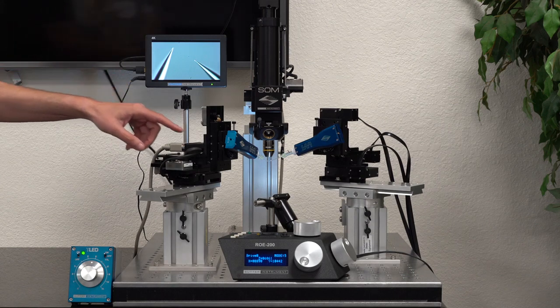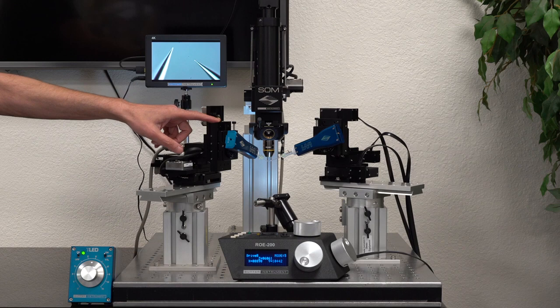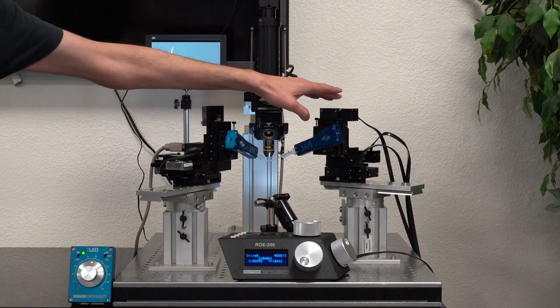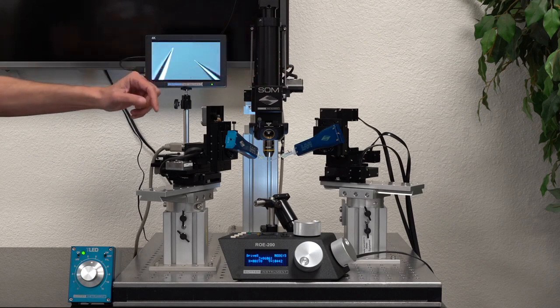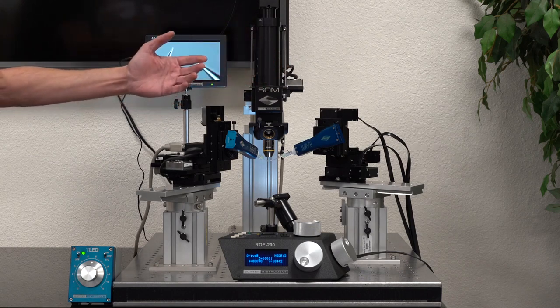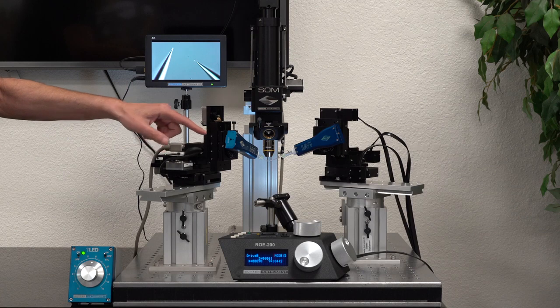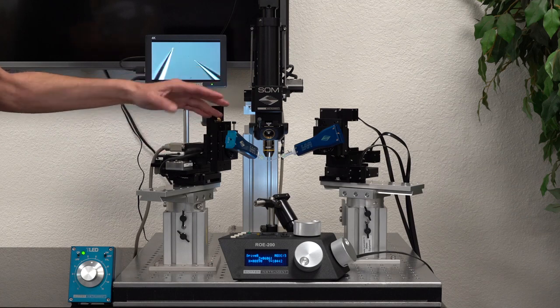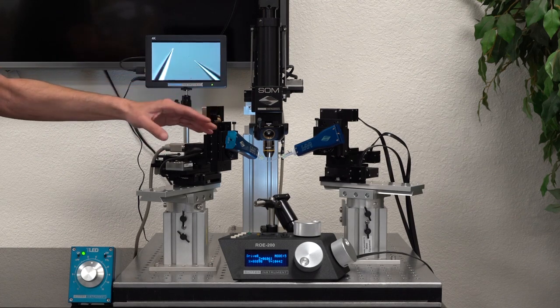In this setup here we have an MP285 manipulator, my traditional manipulators, and an MP225 manipulator. Both of these manipulators are capstan manipulators. That means there is a cable pulling in one direction and springs going into the other direction.